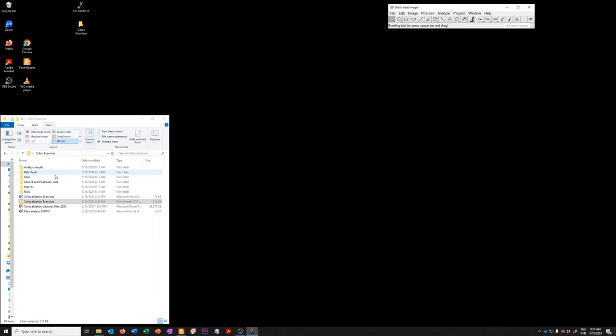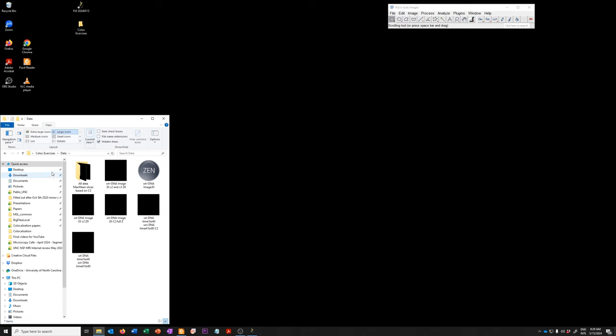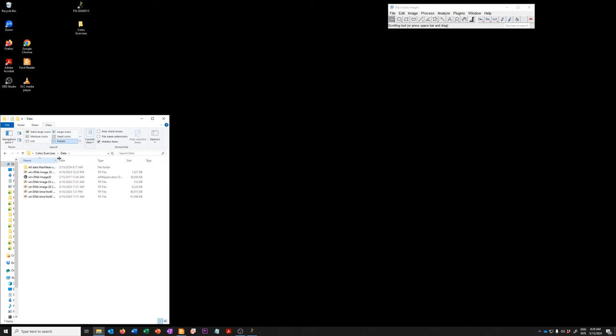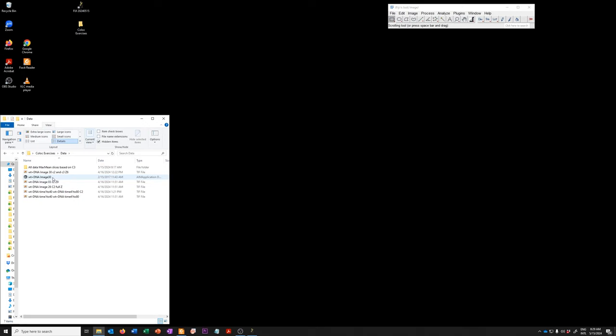To illustrate this, we're going to use a particular dataset that is in the data folder. Specifically, the dataset is called wild type plus DNA image 30.